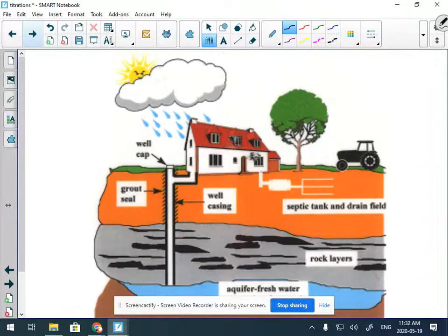Okay, let's talk about the practical application of titrations. What we've been doing so far, you might be like, only chemistry people need to worry about that. And you know what? Some of it is correct. However, anything to do with water in our world, if humans are using that water, it has to go through screening and tests to determine what's in it.